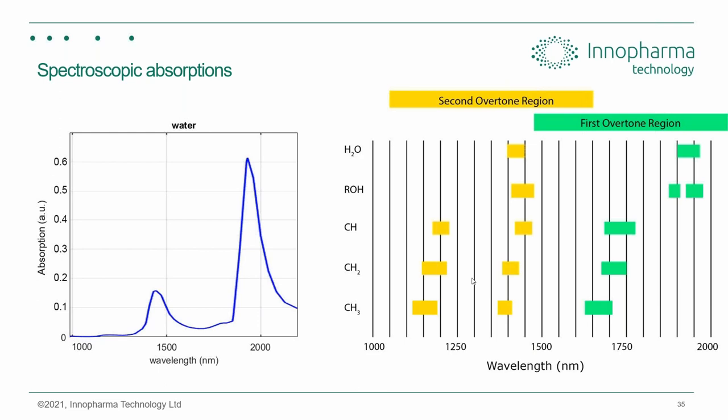The infrared region can be broken up into sub regions. And here, the near infrared is the part of the spectrum that's near the visible part of the electromagnetic spectrum. When we talk about Fourier transform infrared spectroscopy, what we're discussing there is the mid-infrared region. But in fact, it goes further again. Raman spectroscopy is also typically carried out in the high visible range or low near infrared range.